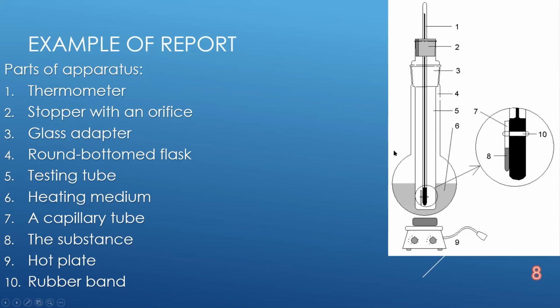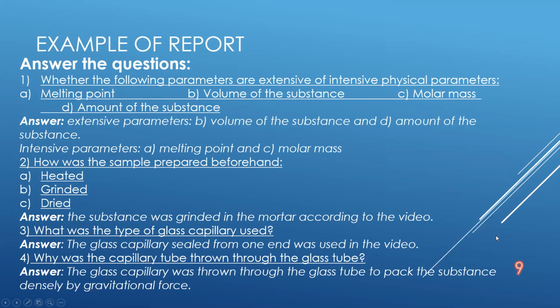So it is a simplified version of defining the melting point. You could also see a more complicated apparatus, which uses electronic heating, and also a microscope to watch more closely at the substance to definitely mark the temperature when it melts. So there can be several types of such apparatus, but in this case we use the simplified type.